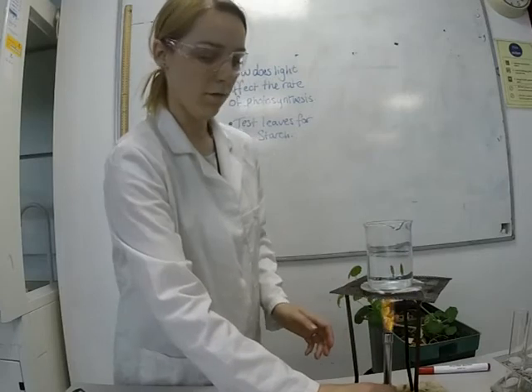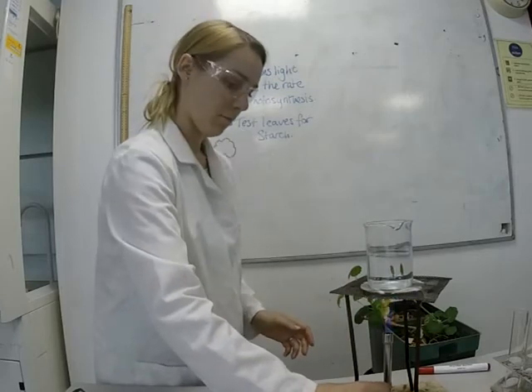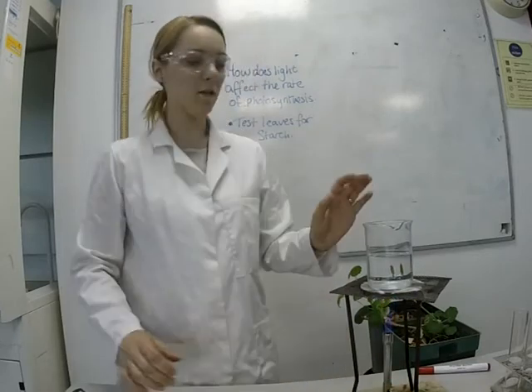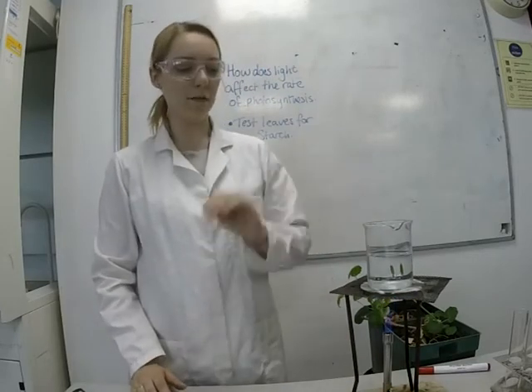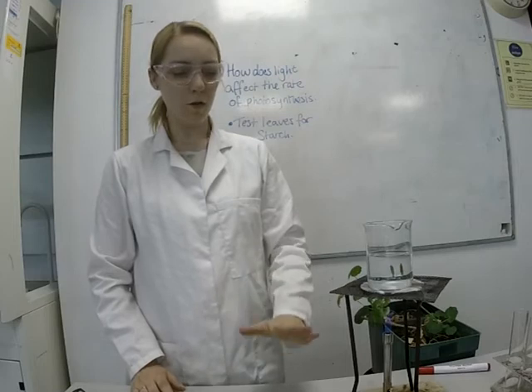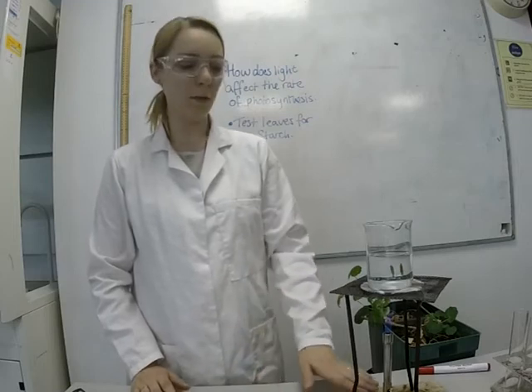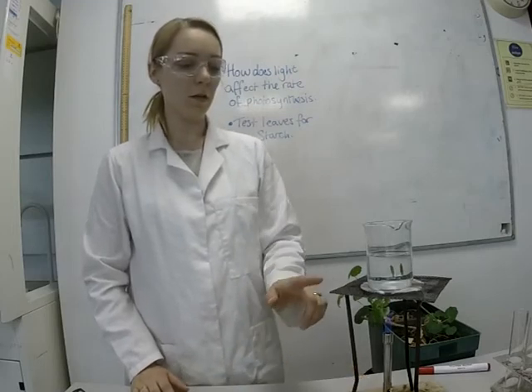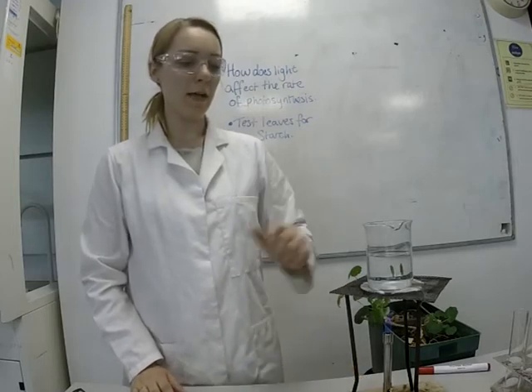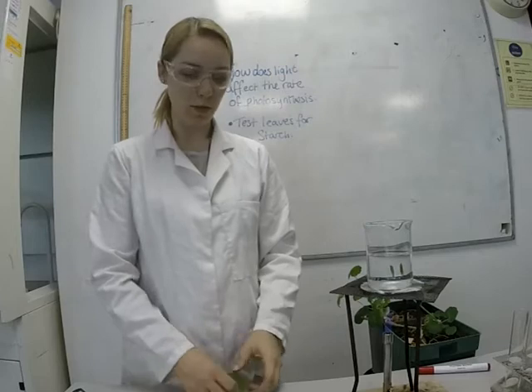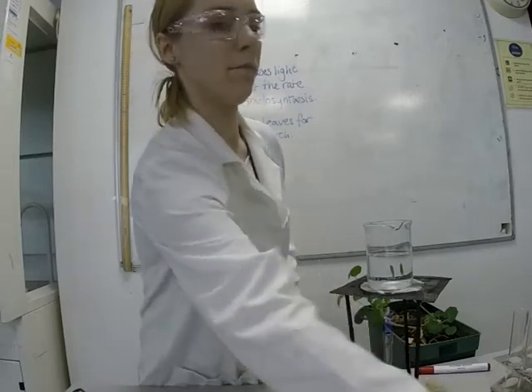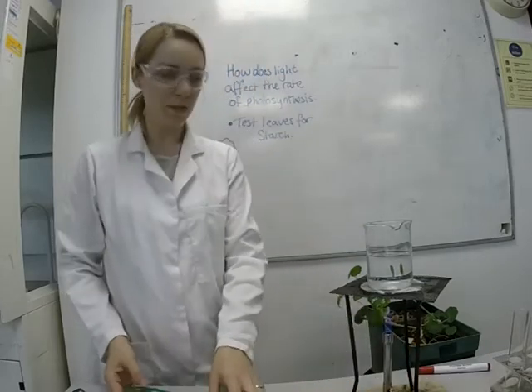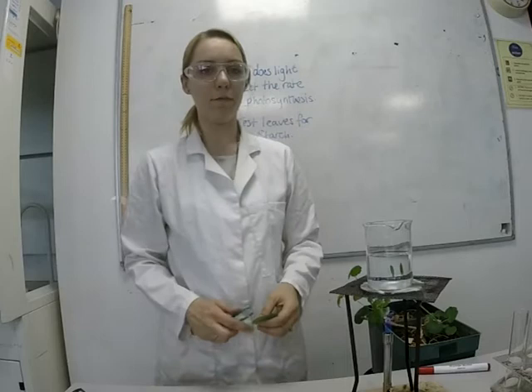To start this off, I've taken hot water from the tap. I've got a heat-proof mat, Bunsen burner, tripod, gauze, and my boiling water. Once that's started to boil, I can put in my leaf.